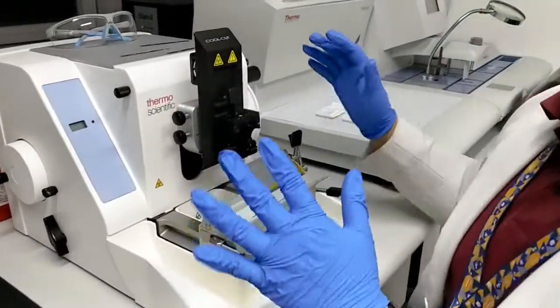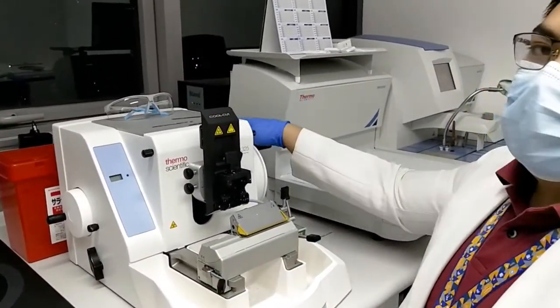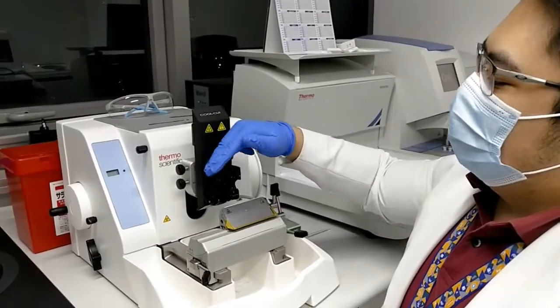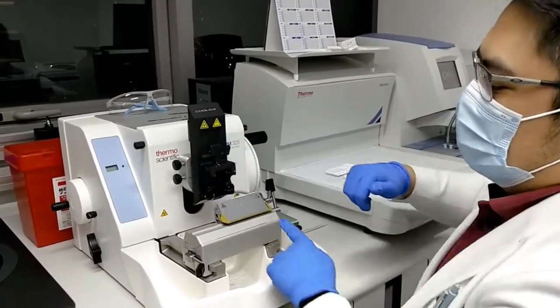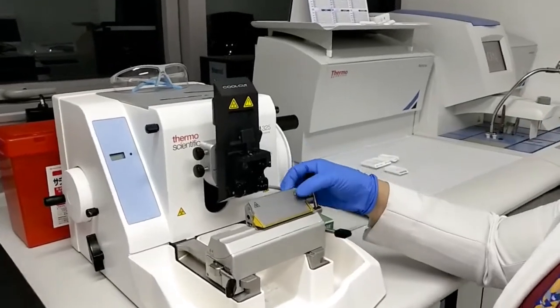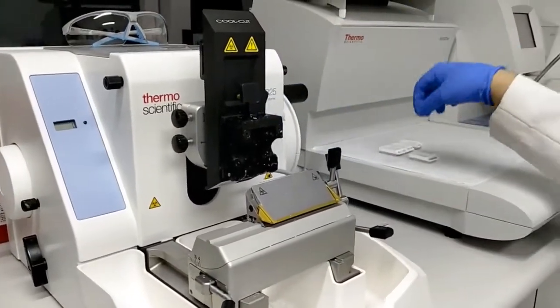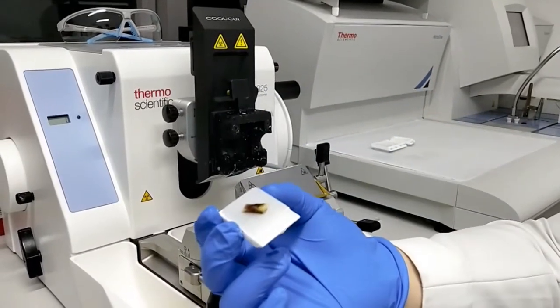In microtomy, we have different parts. We have the rotary wheel, we have the block holder, and then we have the blade holder. The blade holder holds our microtome blades. The block holder holds our tissue blocks. As you can see, we're placing the block there.